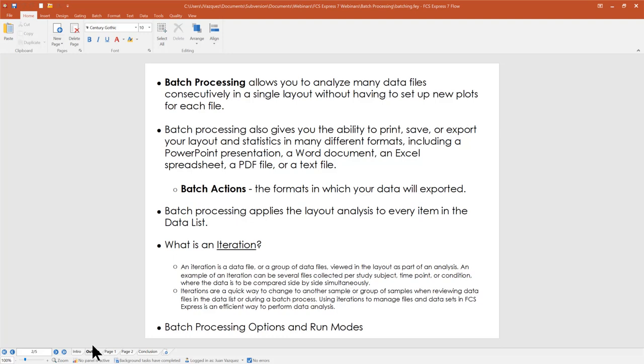In FCS Express, batch processing gives you the ability to take your data and export it in a number of different formats. We do that through a feature called Batch Actions. A batch action is a format or type of action performed on your data as part of the endpoint of your analysis — for example, exporting to PDF, to PowerPoint, or appending data to a spreadsheet. All that can be done through batch processing.